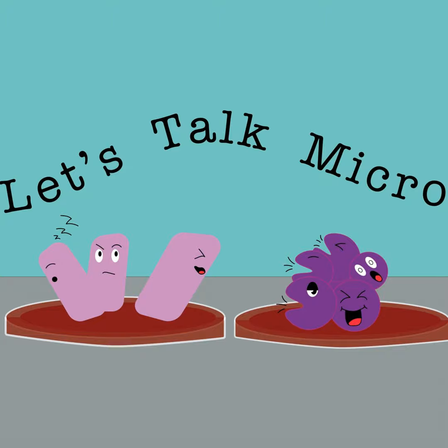And as far as how it works, Nanopore has what they call flow cells, and the flow cells have a bunch of tiny little holes which are called nanopores. These are attached to a sensor chip that transfers the data, and in the nanopores there's a consistent electrical current that flows through it. Whenever a DNA nucleotide passes through the little nanopore, it disrupts that electric flow. The device is able to distinguish this characteristic disruption, or what they call a squiggle.